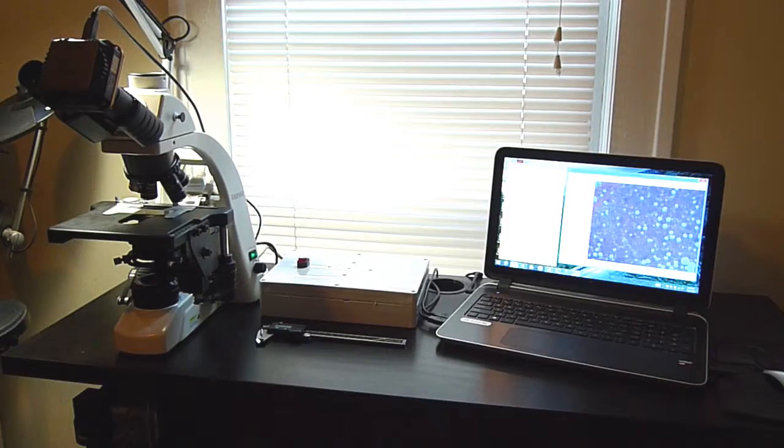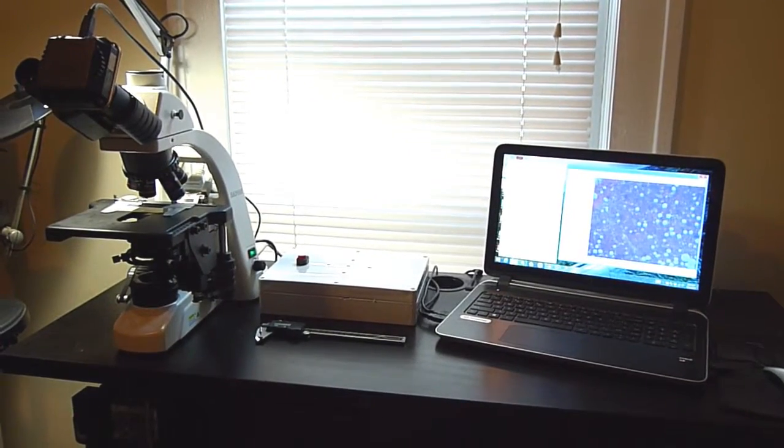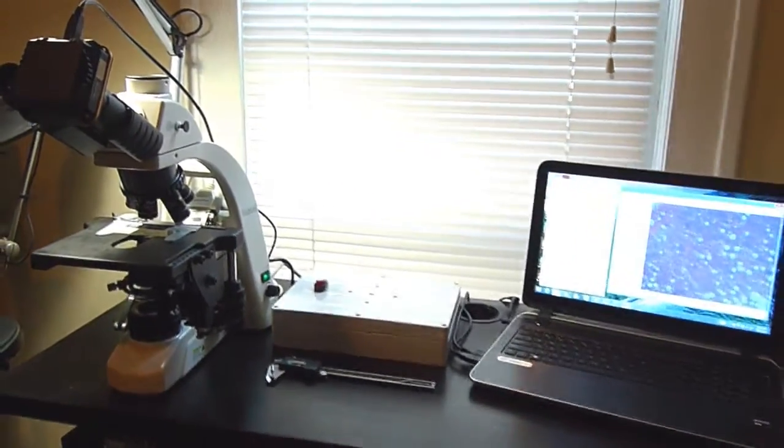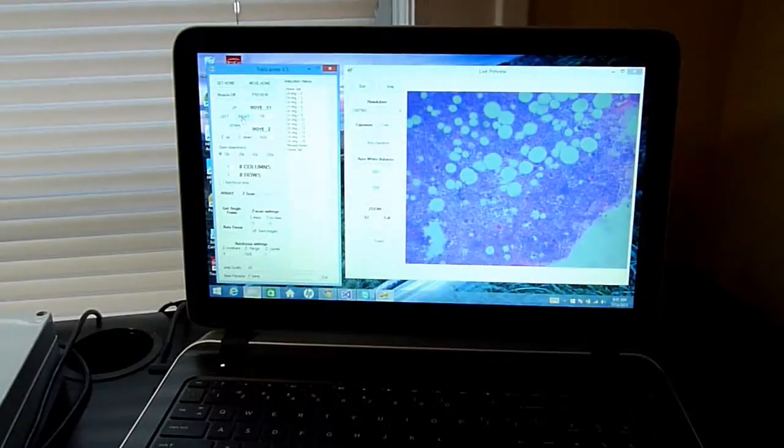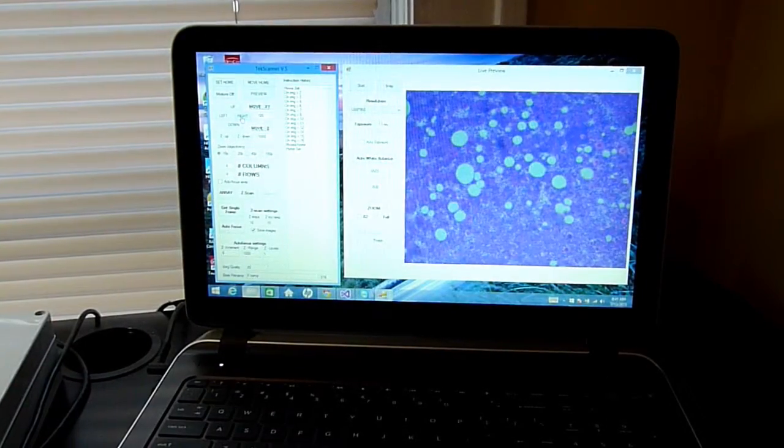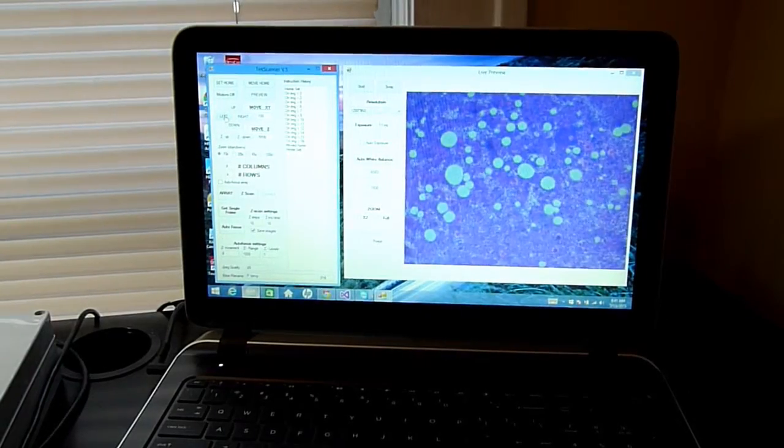So here's the system running live in the office and I'll just focus in here on the GUI and what I'm doing here is just turning on the motors and using the mouse to move the motors in tiling mode.